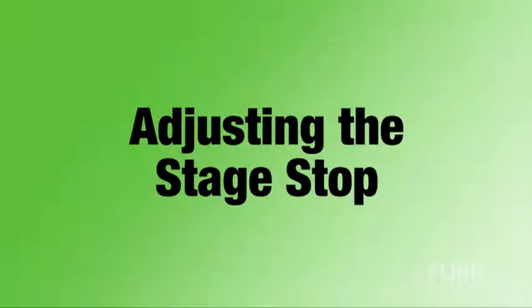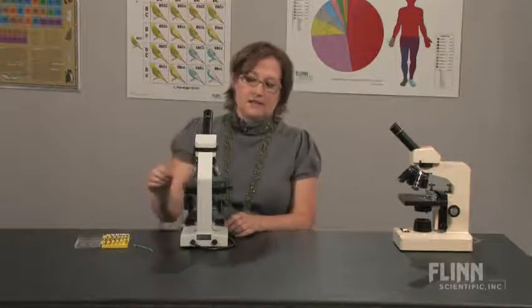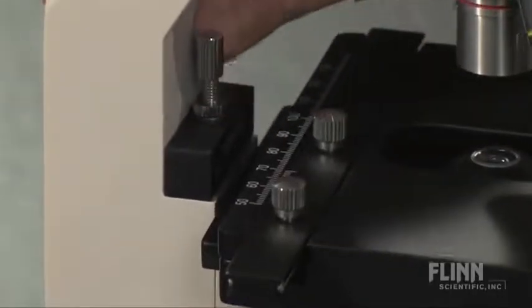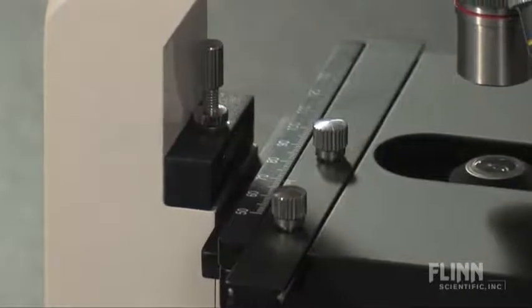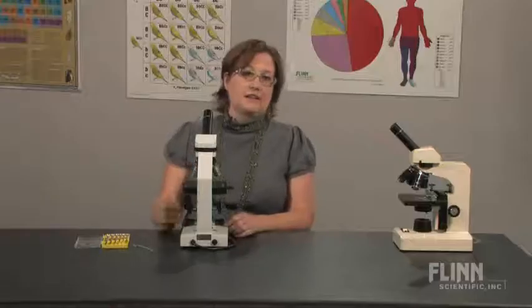The most common reason that a student can't focus on a microscope slide is a dirty objective. The second most common reason is an improperly set stage stop. The stage stop is generally located behind the stage. In this case we have a locking knurled knob and then the adjustment screw which is above it. I have pre-loosened the locking knob.